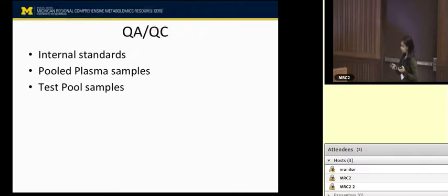These are the common ones we see right now in terms of just the samples that we have identified. But if there is a particular class you're interested in, we can include that also, and we've been working on these methods. This plot shows a class-wise distribution of all the lipid classes. As you can see, TGs are the most abundant in positive mode, followed by PCs, and in negative mode PCs are the most abundant, followed by phosphoethanolamines.